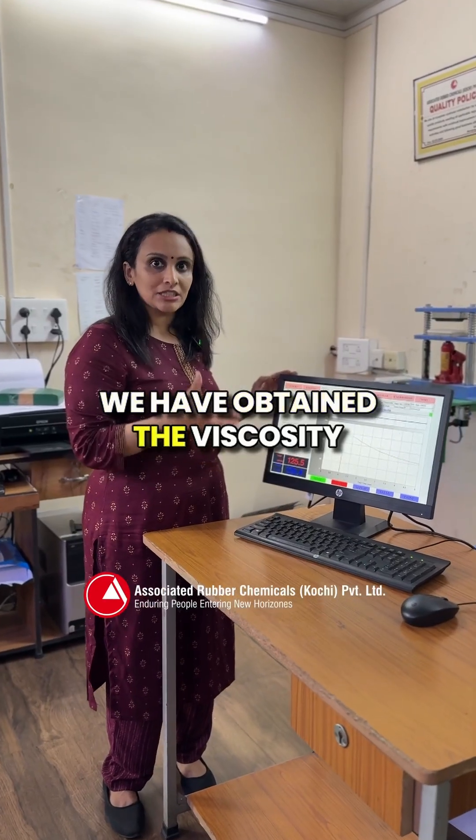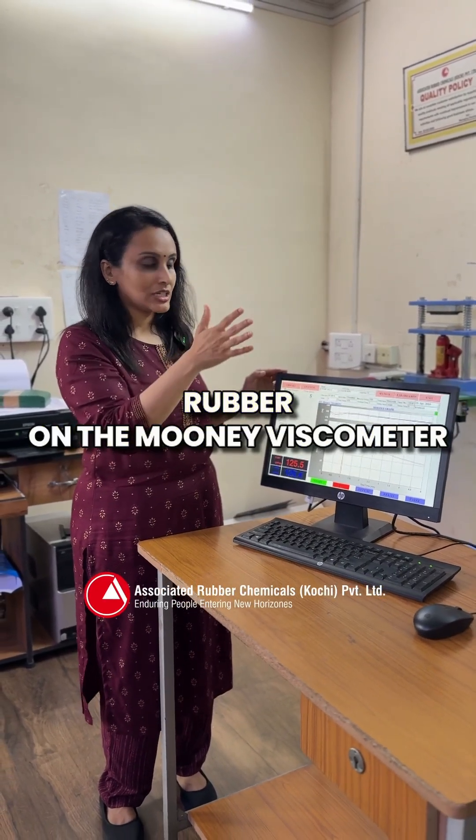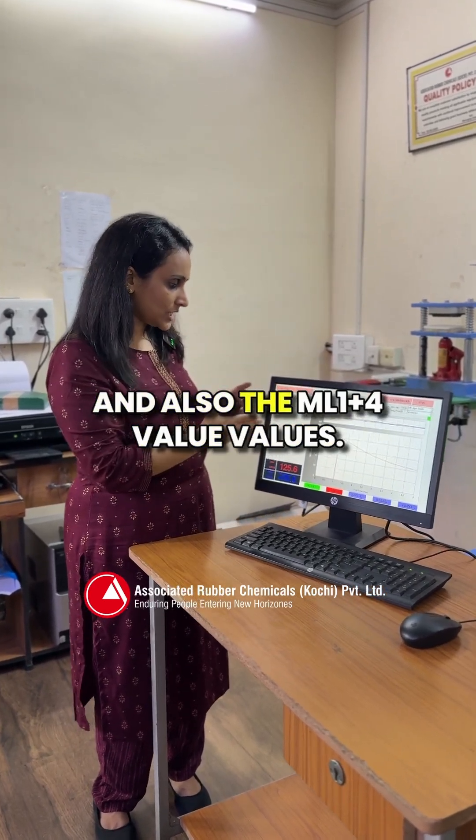We have obtained the viscosity values after placing the EPDM rubber on the Mooney viscometer. We have the Mooney graph here and also the ML 1+4 values. Thank you.